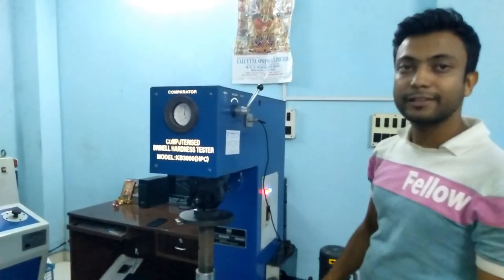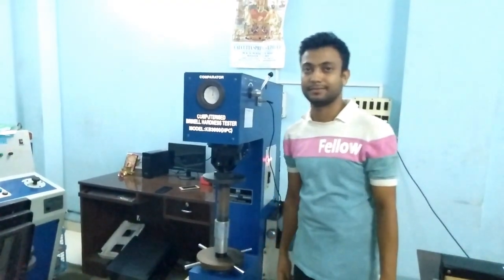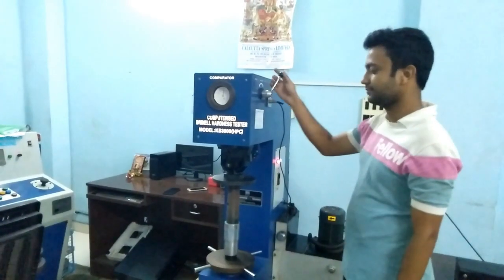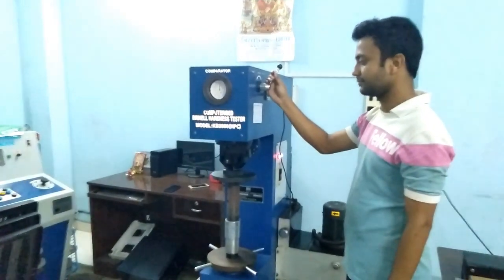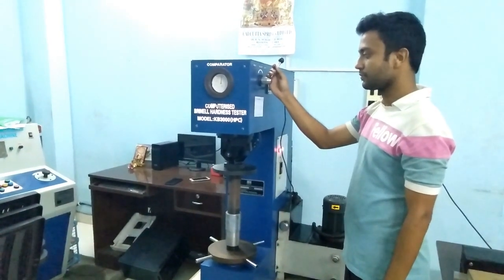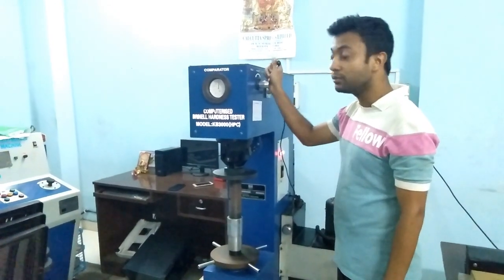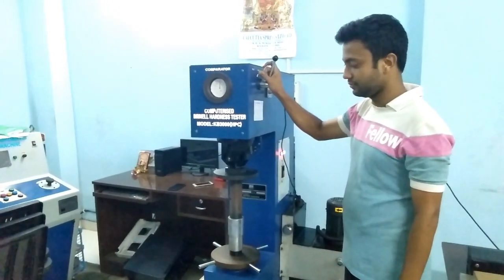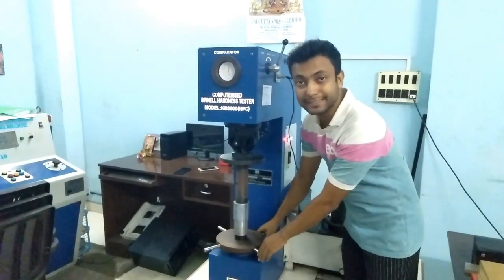After giving the load, we have to wait at least 10 seconds for the indentation. The test is basically over.